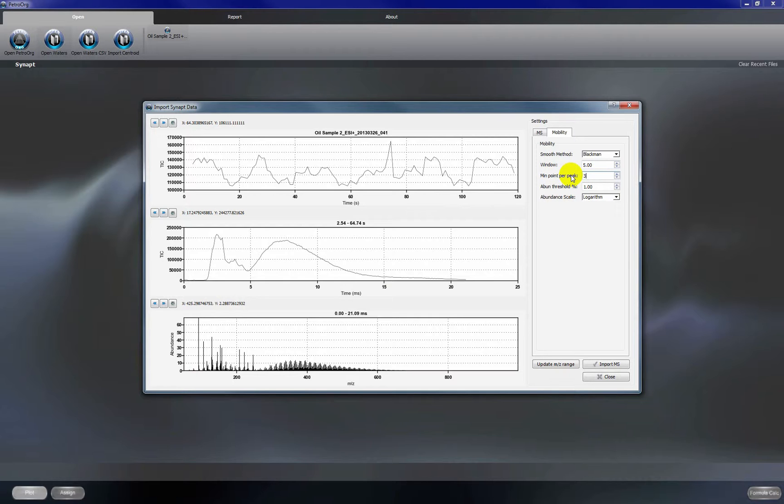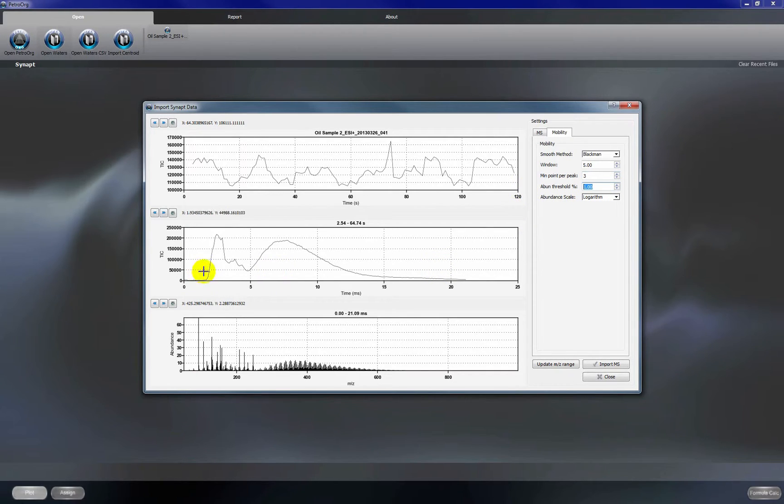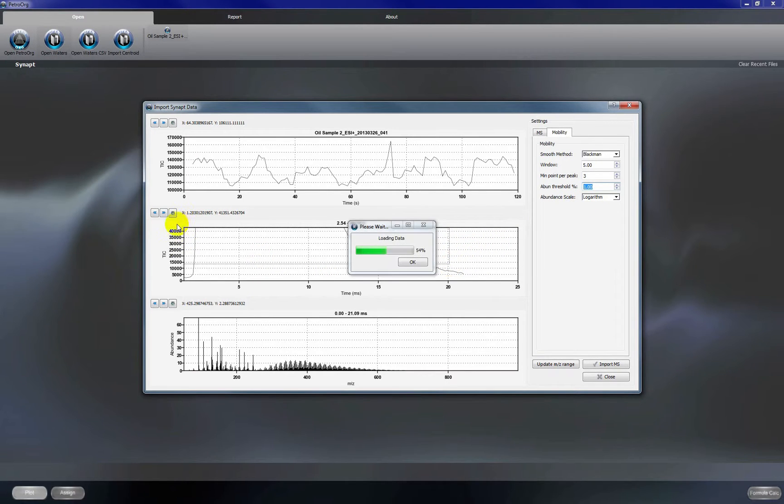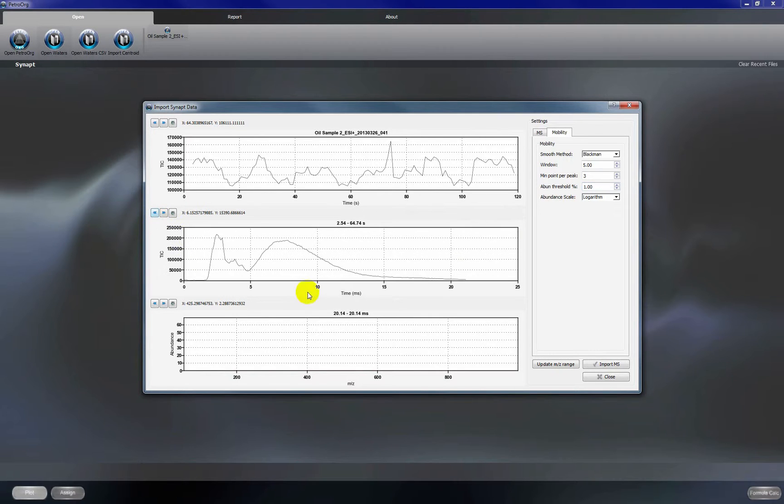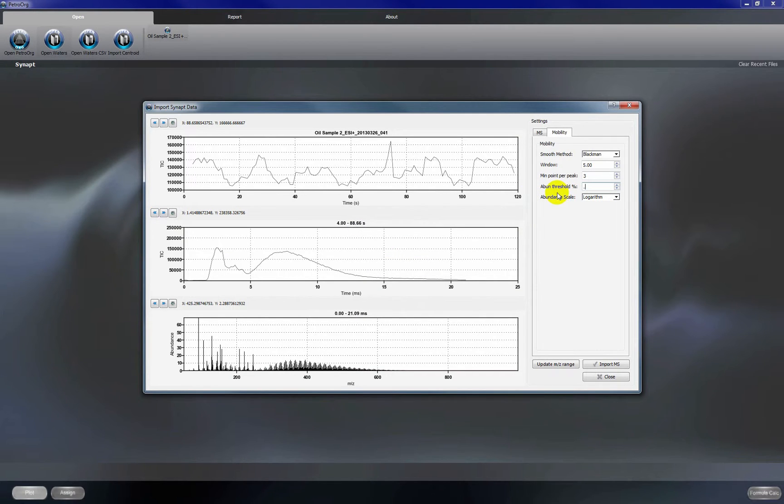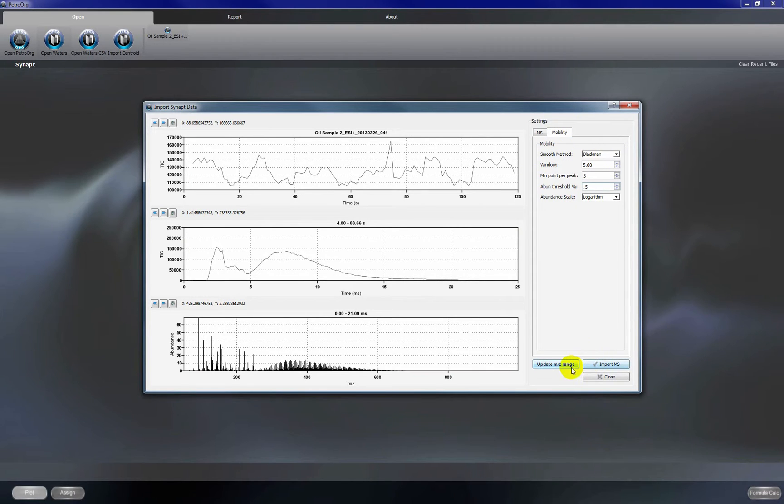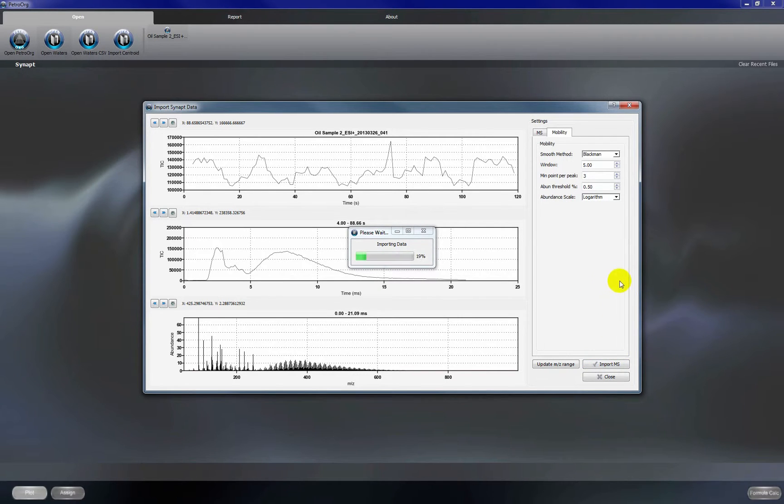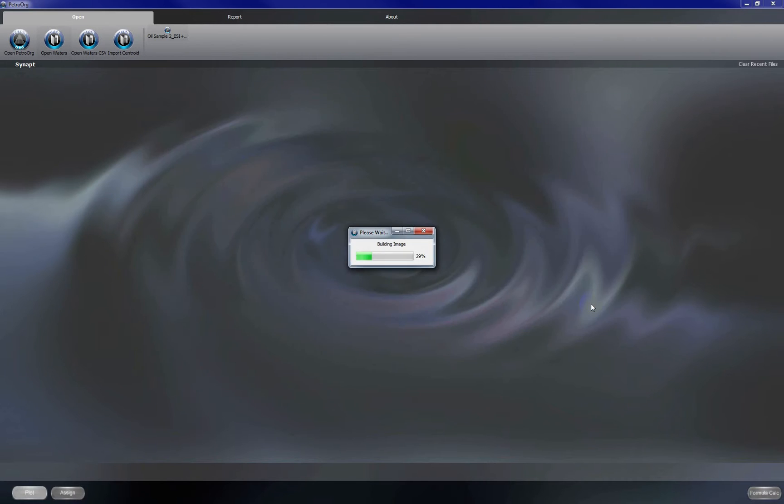Again, three points per peak and we are going to use an abundance threshold of 0.5 again. Alright, so once we have all of these settings entered, we will click import MS and this will import the data as a list of peaks that we've chosen based on these settings.